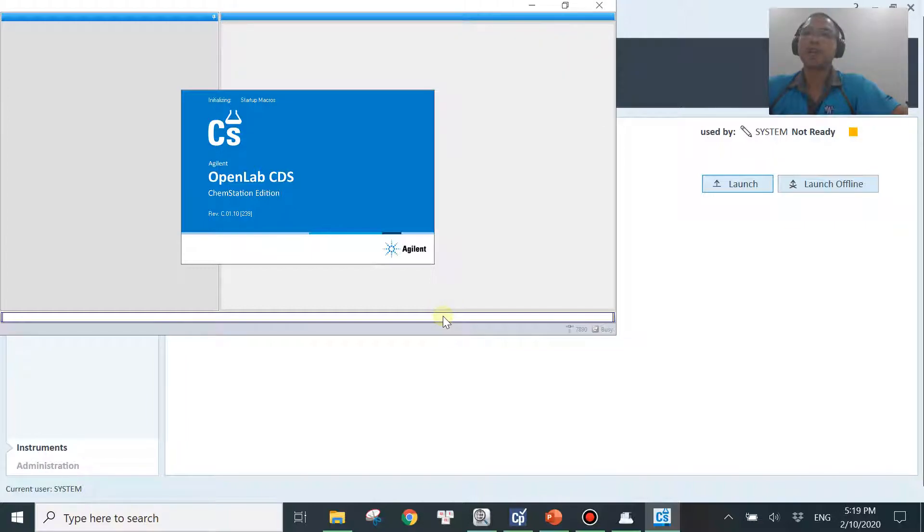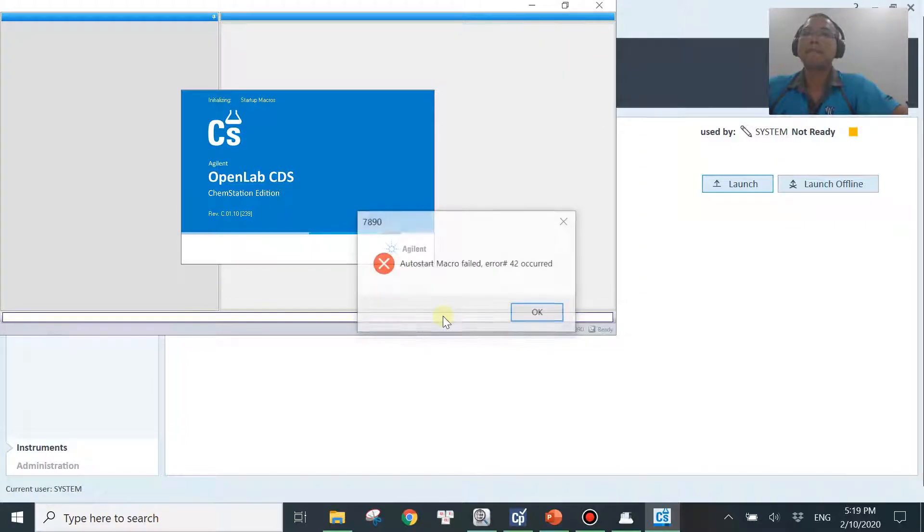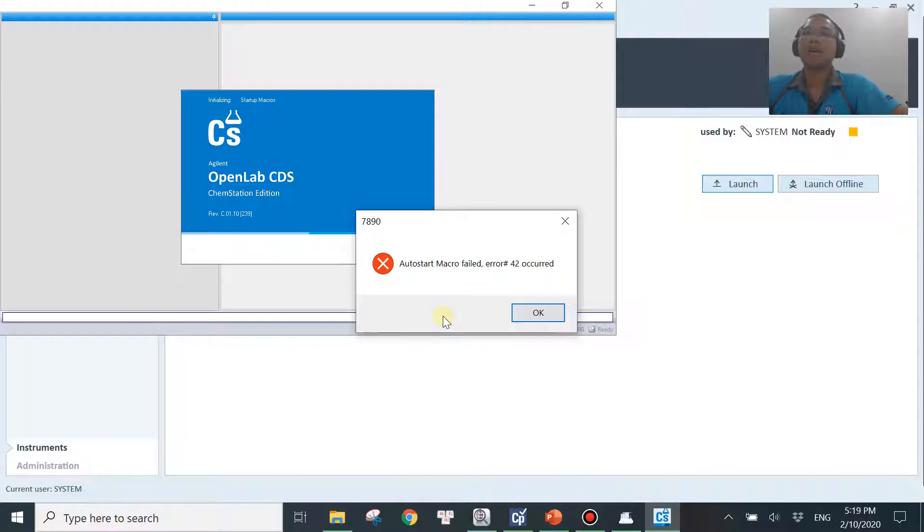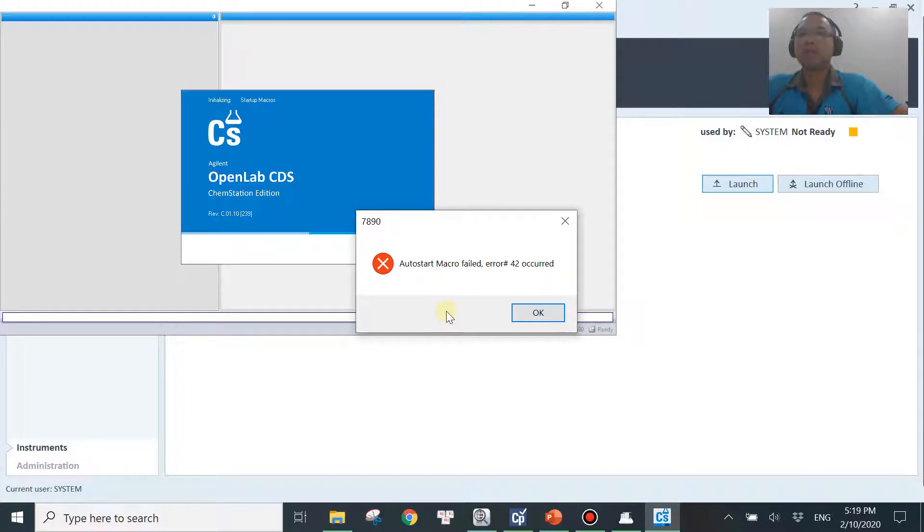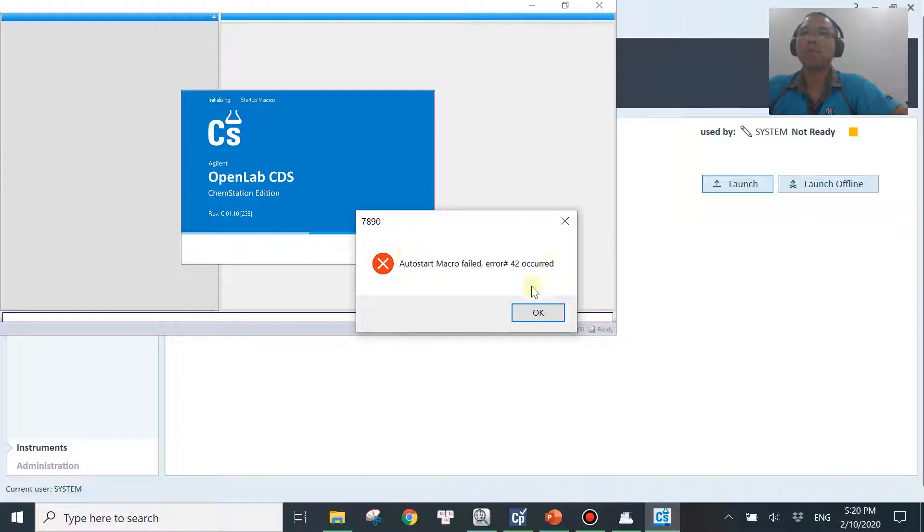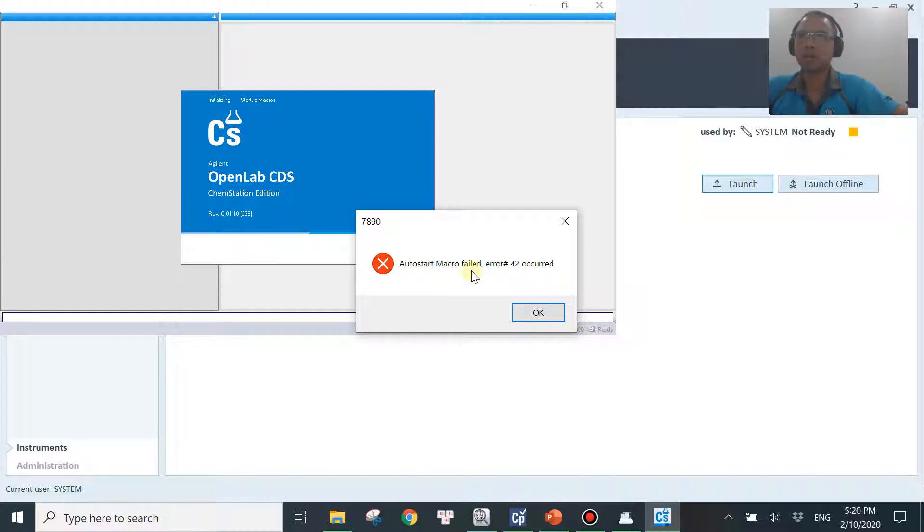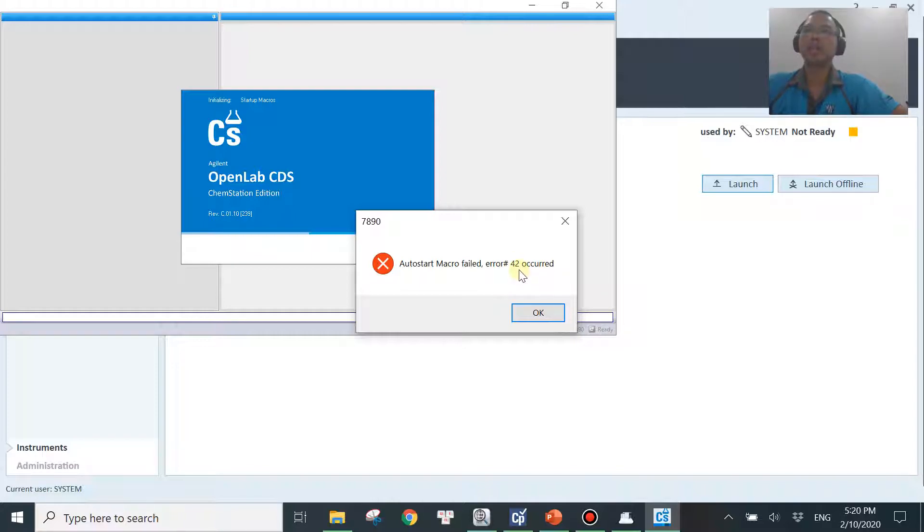Be patient. Alright, so there you go. So what you see now is it will show you an error message from here and it will stop you from launching the software. It will say auto start macro failed. So that means something is wrong, right? You can launch your software and you'll see the error code over here, which is 42 in this case.